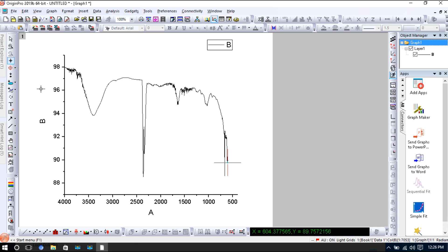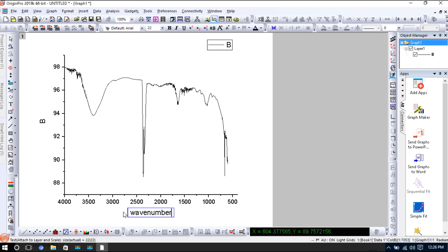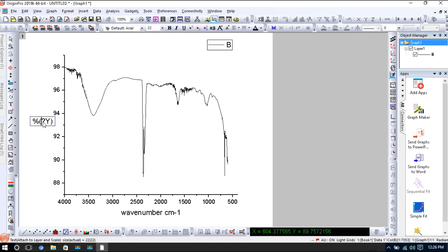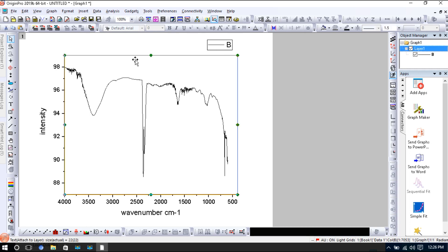We will change this into wavenumber, centimeters inverse, and this into intensity. The name of your sample you can write it here.